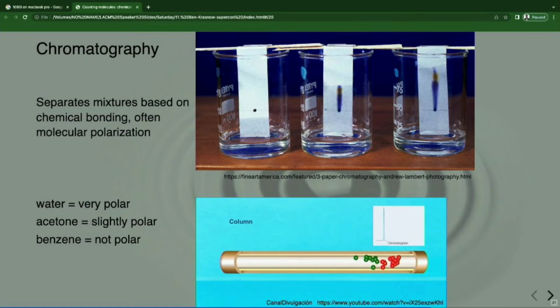It's so simple it's almost hard to understand, but one compound moves through the tube more slowly than the others, and you end up with this beautiful separation without really doing anything. There are no moving parts. The only difficult part is figuring out what the chemical composition of that tube coating should be. That's a little bit tricky, but it's not too bad.